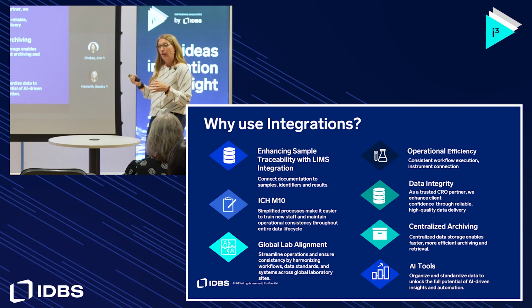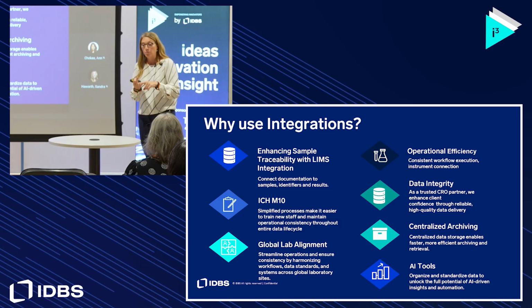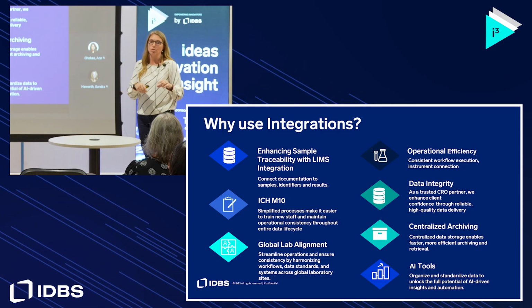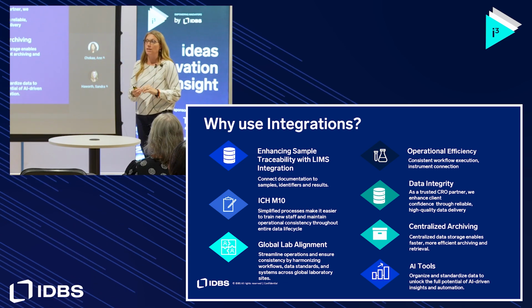And if we find that something about the sample needs to change, or we want to import more data about that sample, we can export a file from the accessioning experiment and import it into Watson. So it really is a full circle of being able to get all of the comments and notes about that sample either in Watson, and the documentation is there in ELN.